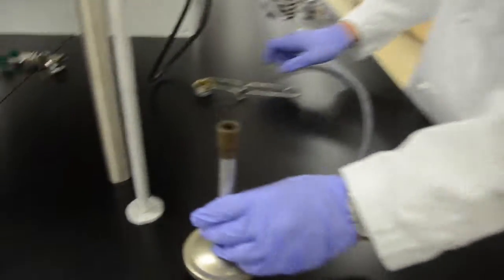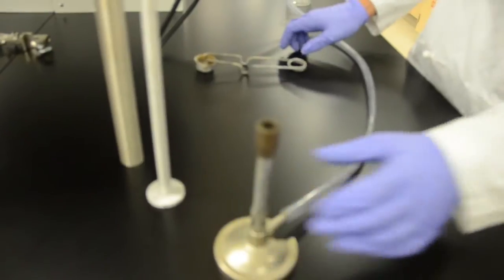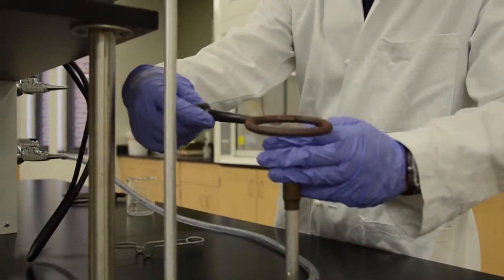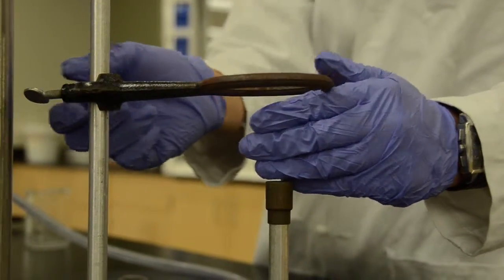After making sure that the connections are tight and secure, place the Bunsen burner directly below the mounting stand. Measure about three fingers above the tip of the Bunsen burner and firmly attach the first ring clamp at that height.